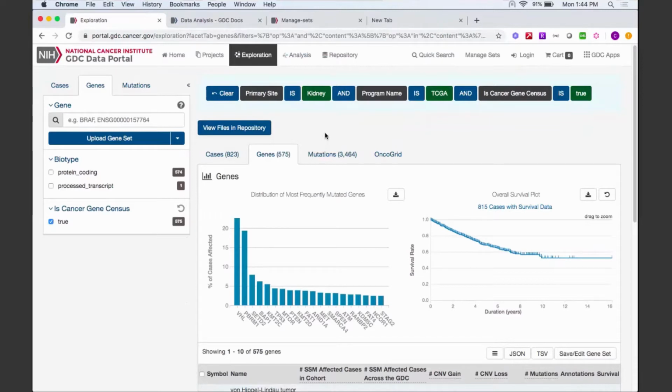The other thing I was thinking is that gene length is actually an available filter through the API, so there is a potentiality of putting in, I don't remember what the field is, I would have to look that up, but I believe you can just add a filter that would say, just show me genes that are less than 200 amino acids. It's not a default option here, but it is possible, I think. Yeah, that's a good point. We can enable you to do those selections on your own, but the GDC doesn't have one by default in terms of how the genes are displayed.